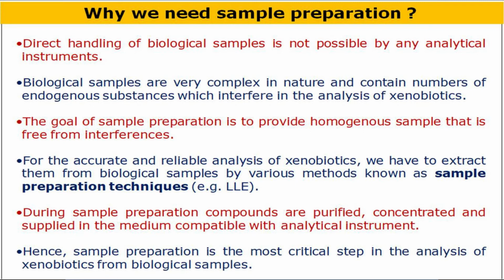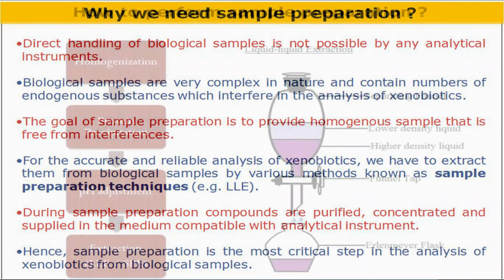And the most common example of sample preparation techniques is liquid-liquid extraction, which is known as LLE also. So during sample preparation, what happens? We purify and concentrate our target analyte in a medium which is compatible with analytical instruments. Medium means we are just extracting our xenobiotics in an organic solvent, for example, chloroform. Chloroform is compatible with gas chromatography, mass spectrometry. It is compatible with spectroscopy. It is compatible with other analytical instruments also. So this is the reason why we need sample preparation.